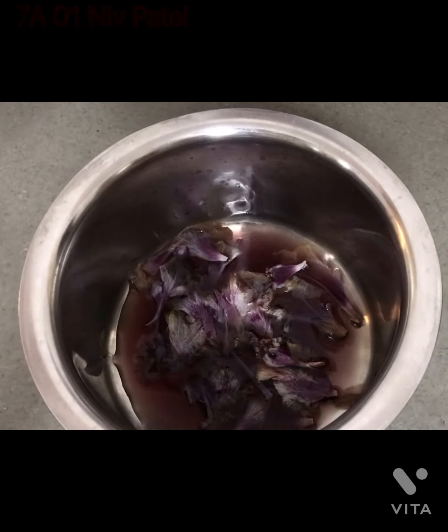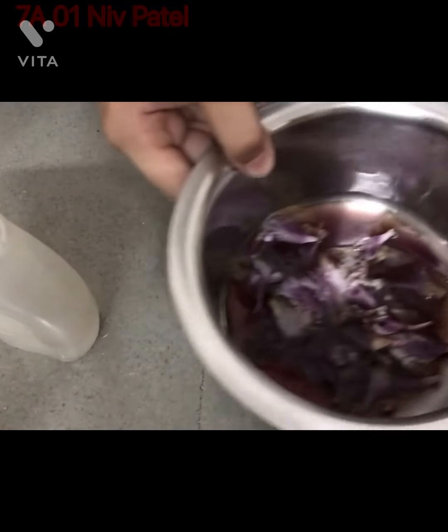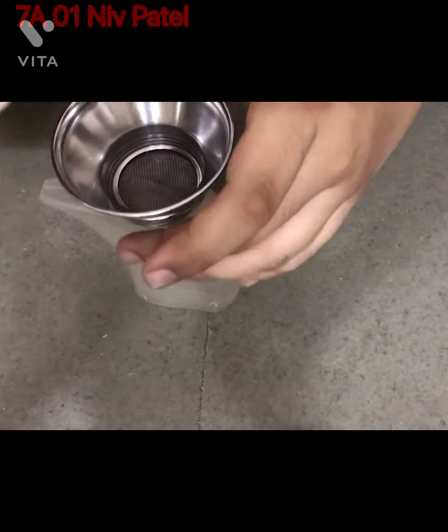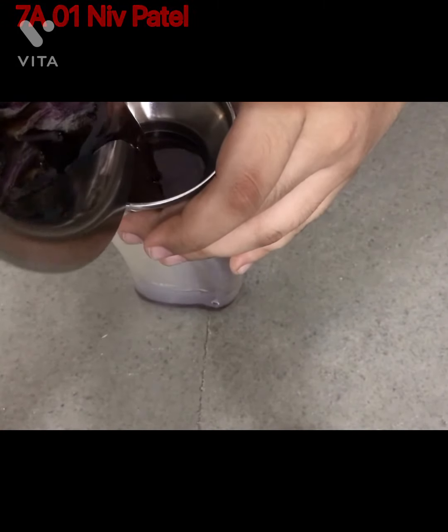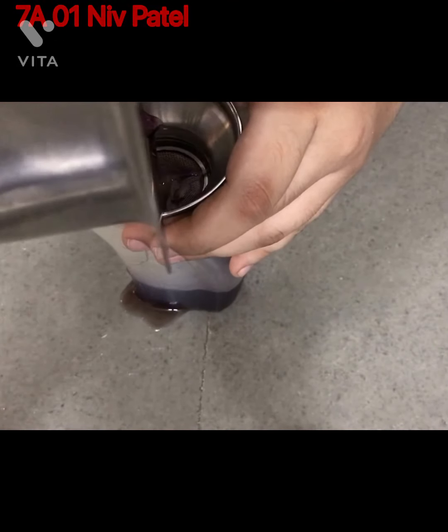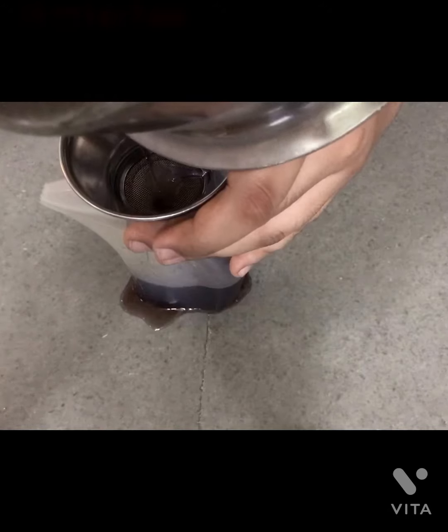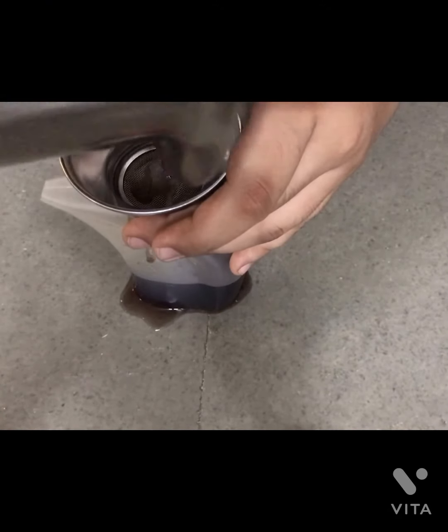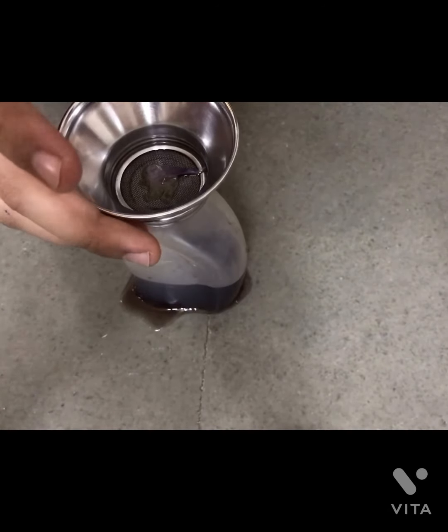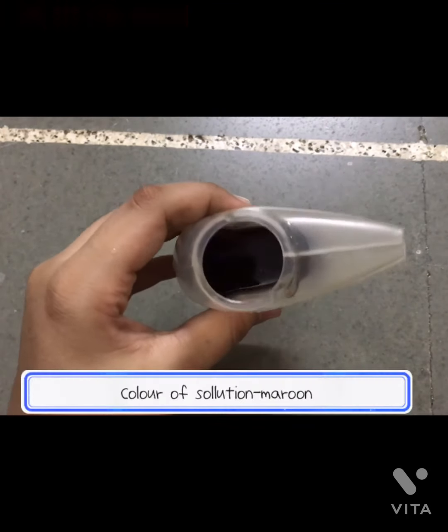Now you can see that the solution has cooled down. Take a beaker and a sieve to filter the solution. Now it is done — take the sieve, filter the solution, and you can see that our solution is ready. It has got quite a maroonish color.